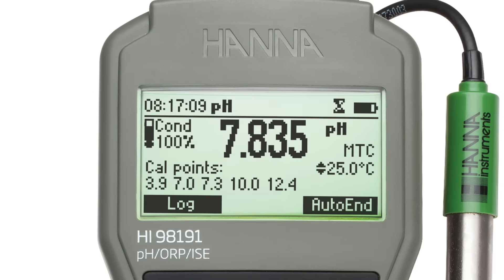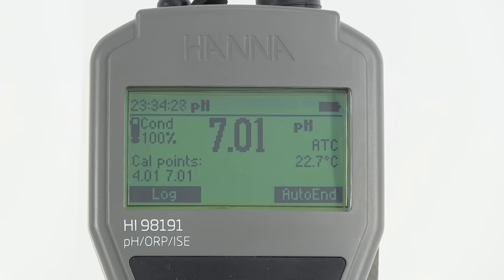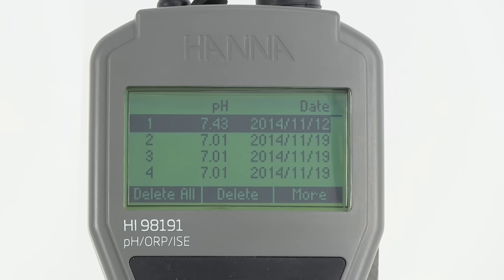Both meters feature a large backlit dot matrix display and dedicated keys for calibration, setup, GLP data, and contextual help. Logging data is easy with the simple press of a button.